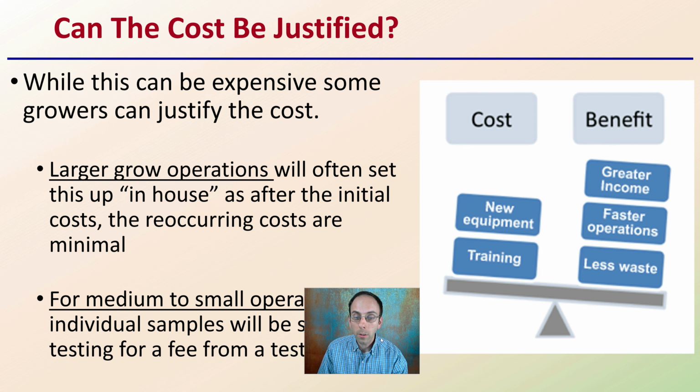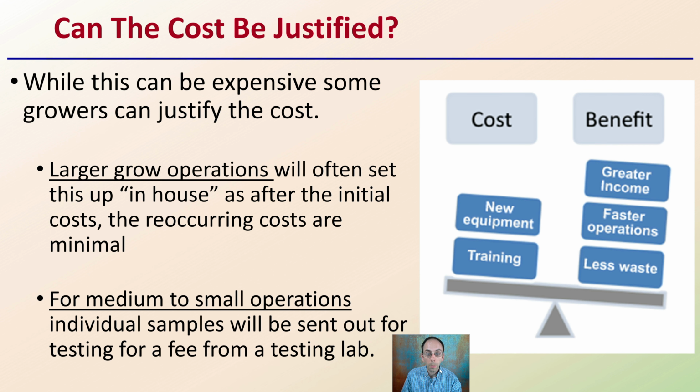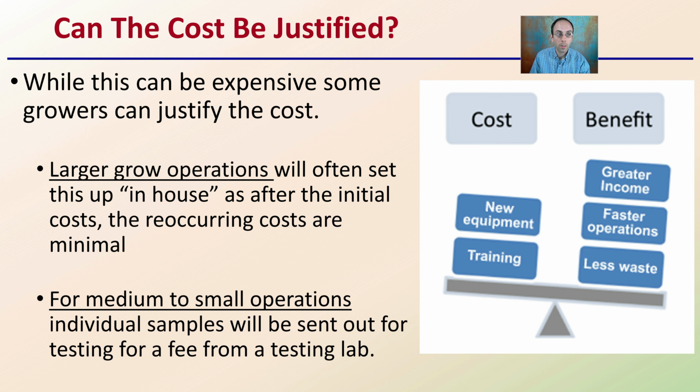Now, can the cost be justified? This is one of those constant questions when we're looking particularly at PCR. Can we justify the cost of PCR? While this can be expensive for some growers, some can justify the cost. For larger grower operations, they'll often set this up in-house, meaning they'll conduct these PCR treatments within their own grow facility. After the initial cost, once you purchase everything, the recurring costs are actually quite minimal.